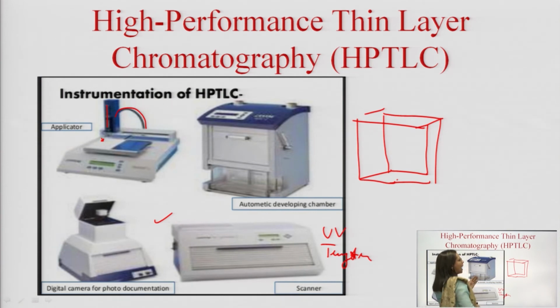HPTLC plates, and when it compares with the control, the density could be assessed here in a software which is already automated. They follow the WinCATS software, and finally whatever result or band that we have obtained is visualized in this digital camera, which is able to preserve it in soft data.